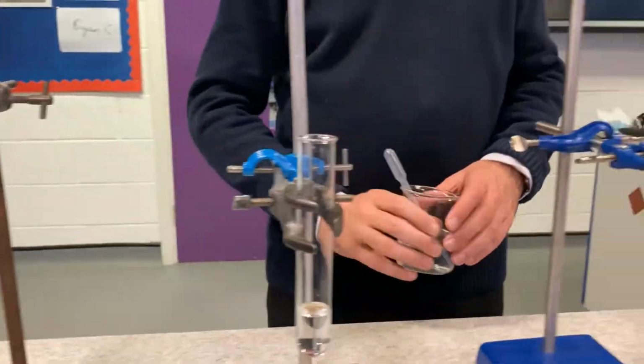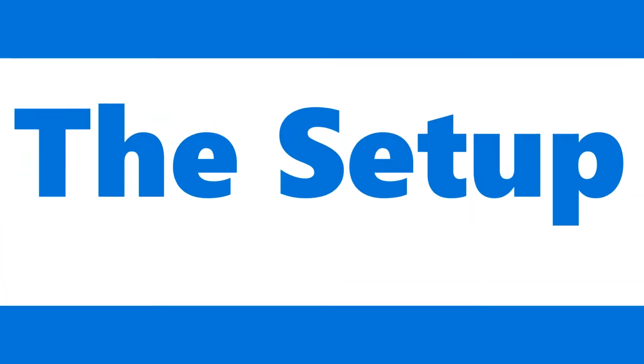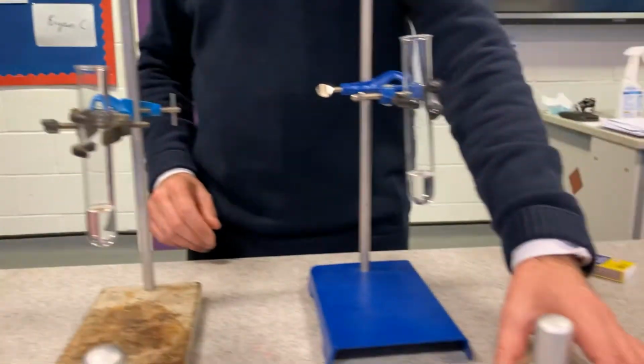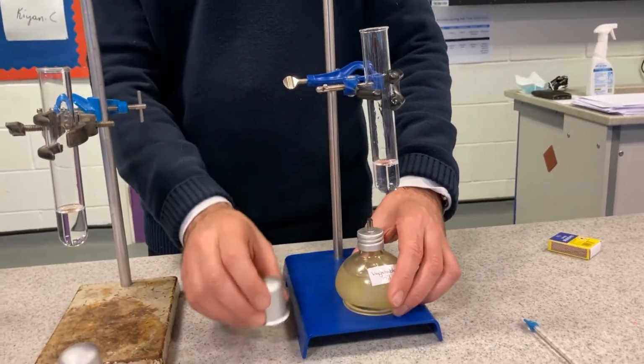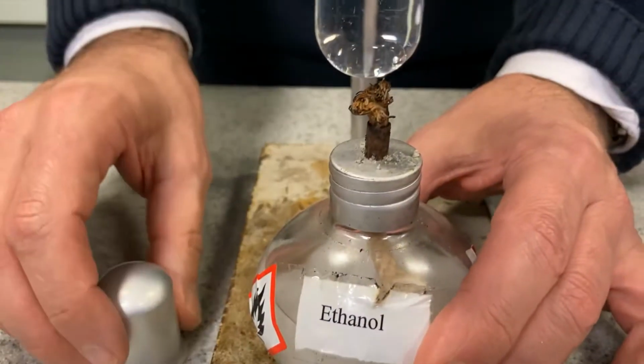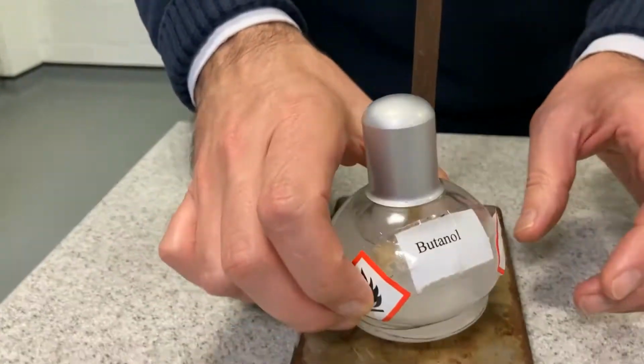Right then. So, I've got three fuels. I've got this one here, vegetable oil. And I've got another one here, which is ethanol. And I've got a third one here, which is called butanol.